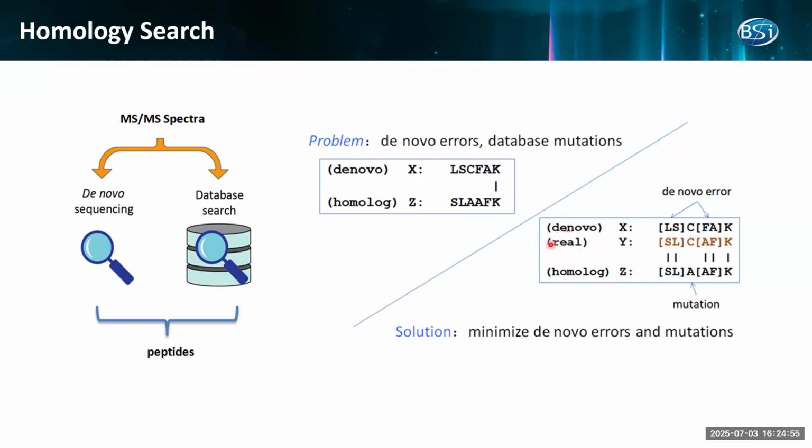In this case, the homologous search will come up with this sequence, which takes our knowledge base, like database information, and also shows respect to the mass spec information. In that position, we do observe the fragment ion to support its annotation. So this algorithm, I think, compared to DDA, is more important for DIA. So in this release, we put this into our DIA analysis workflow, including proteoform and peptome.